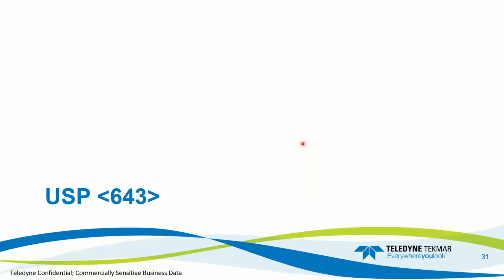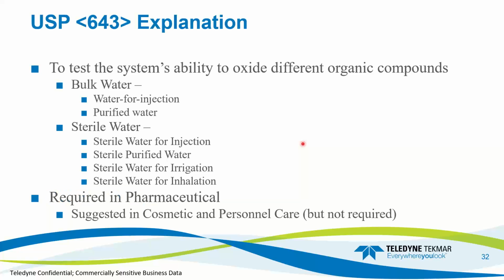The other method that goes hand in hand with this is USP 643. So what is USP 643 and where is it used in the process? It's used to test the system's ability to oxidize different organic compounds. And on what, you might ask? Well, bulk water.